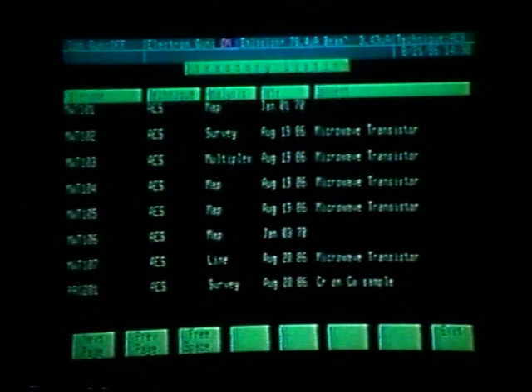MWT 101 says it is a map. That was the first SEM image which we acquired at 5000X. MWT 102 is our first survey scan, that being on the 3 defined areas on the microwave transistor. The file we would like to load and display and demonstrate data massage for survey scans would be file MWT 102.